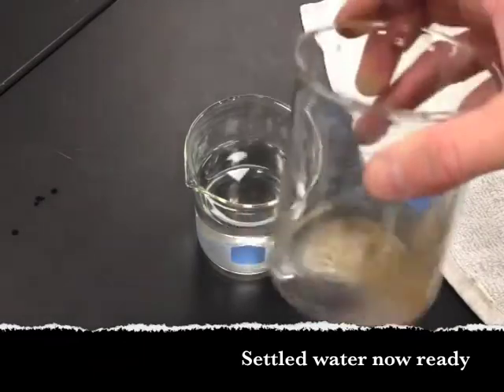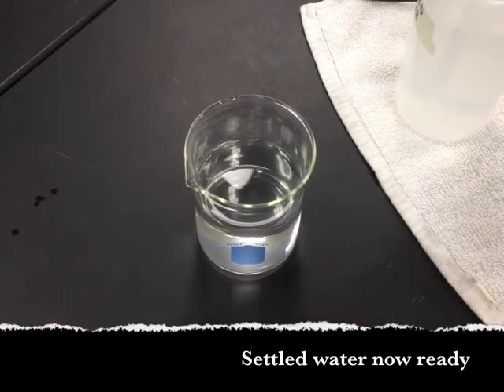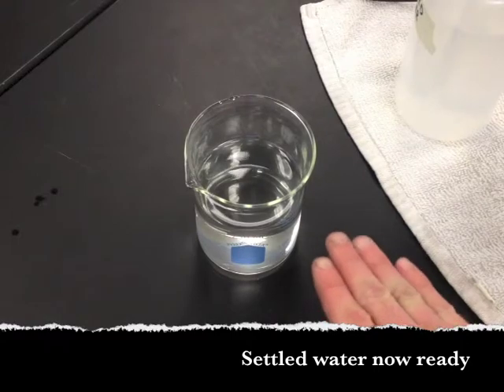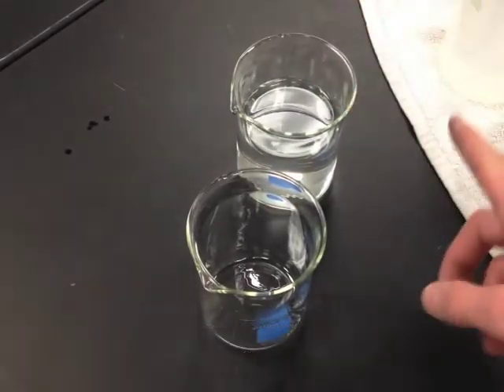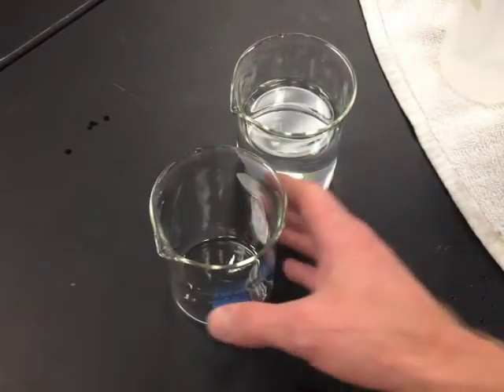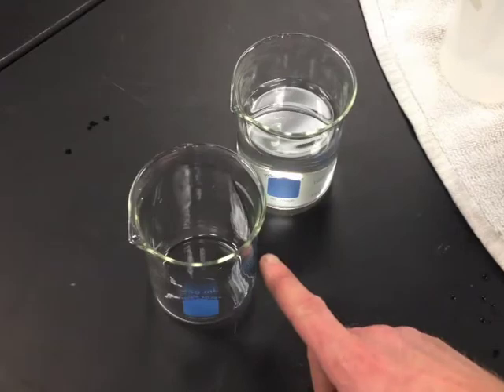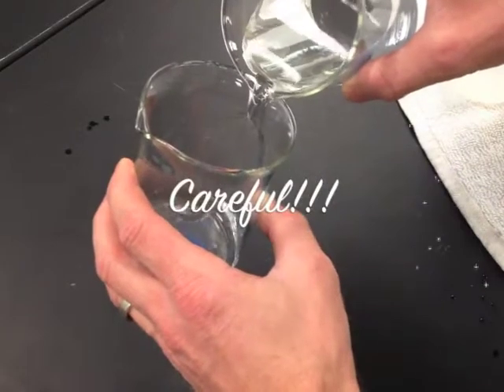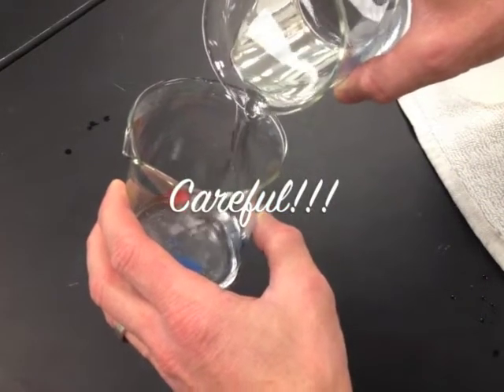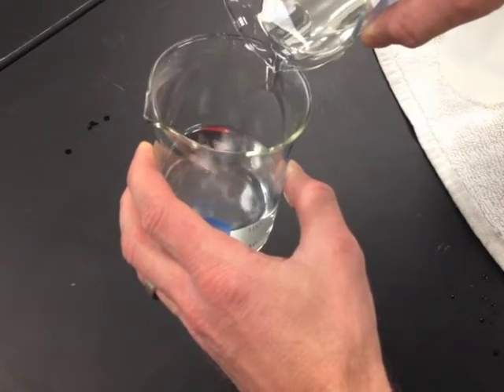While doing those readings, the sample I set aside to settle has been settling. I haven't disturbed it. Any particles that settled to the bottom — I want them to stay there. So carefully transfer the contents that have been settling into another very clean beaker. Make sure your glassware is clean with no residue or salt on it. I'm going to carefully pour most of it — not all of it — into another beaker, which will be my settled water sample.